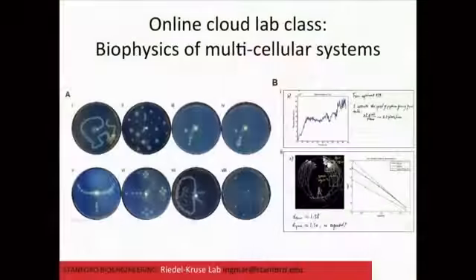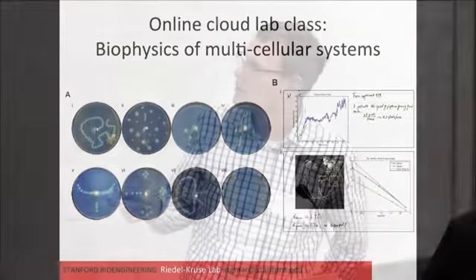And so I used this setup in a class at Stanford, a graduate level class that I taught, where the students essentially ran experiments over 10 weeks. And you see some examples where a student, for example, tests whether the organism can distinguish between lots of food versus little food, how strong of a kink it can follow, things like those. And then the student would analyze the data, measure fractal dimension, growth speed, and also make some models.